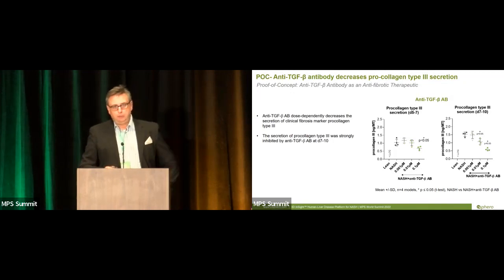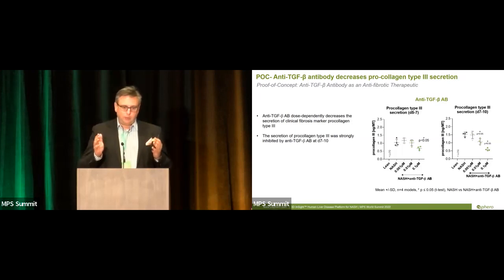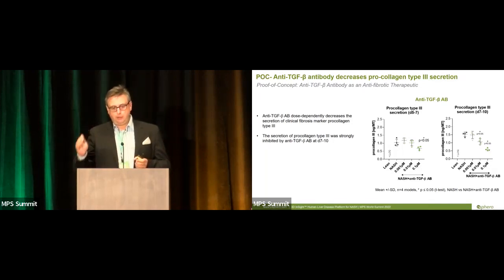Our screening compatible endpoint to look at collagen is measuring procollagen 1 and 3 in the supernatant. You see the procollagen 3 data on this slide. What's really nice is you see the dose response that works both on day 5 and on day 7 to 10 in this data set.